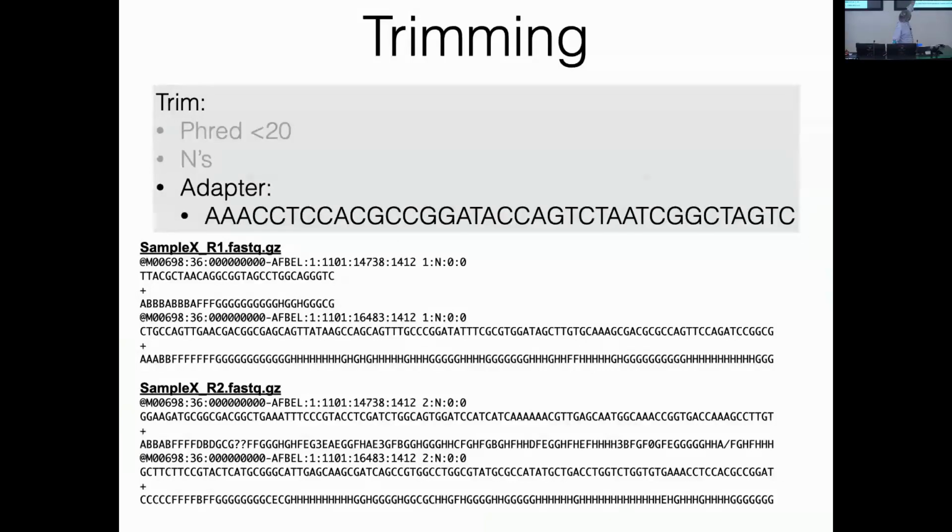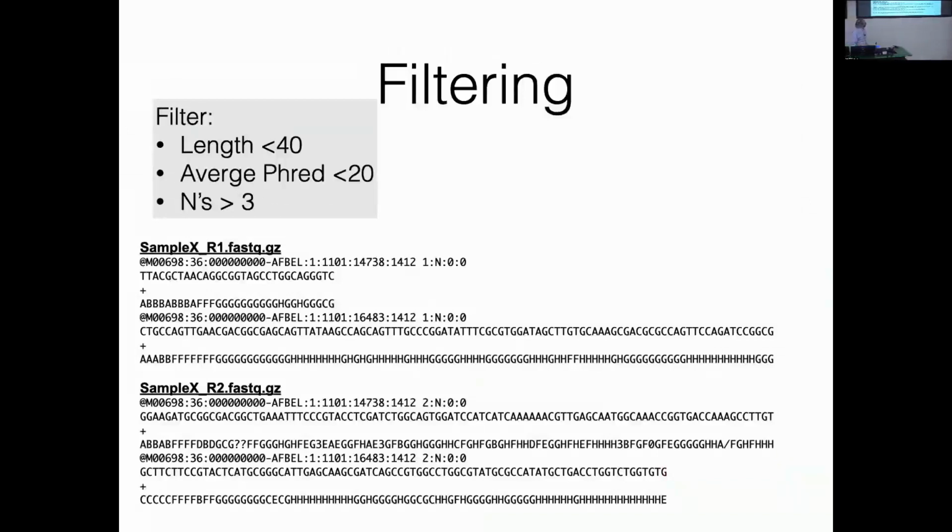We're going to be looking for that adapter sequence. And if we find that sequence or part of that sequence, we're going to have some threshold, because we're not just going to look for A or AA. Usually we have a threshold of, say, 8 or 10 base pairs. If we find that, we're going to trim 3' of it. Here we have a match that's about 15 base pairs, so that's a good solid match. We're going to trim there and get rid of that. And then this is what things look like after our trimming.